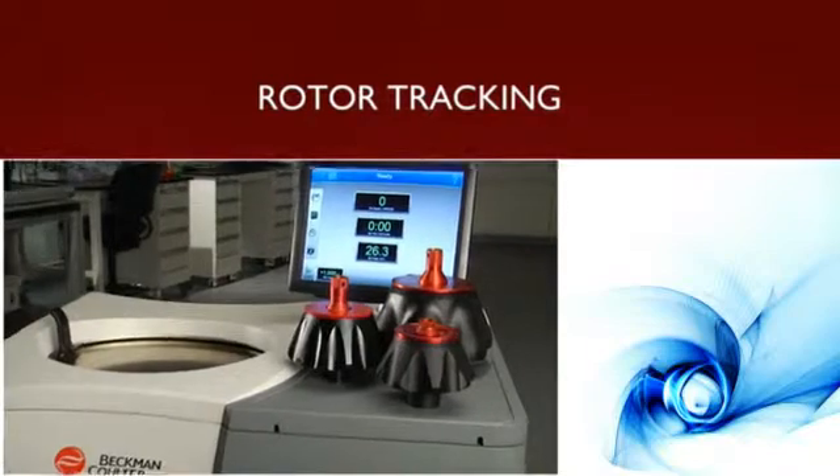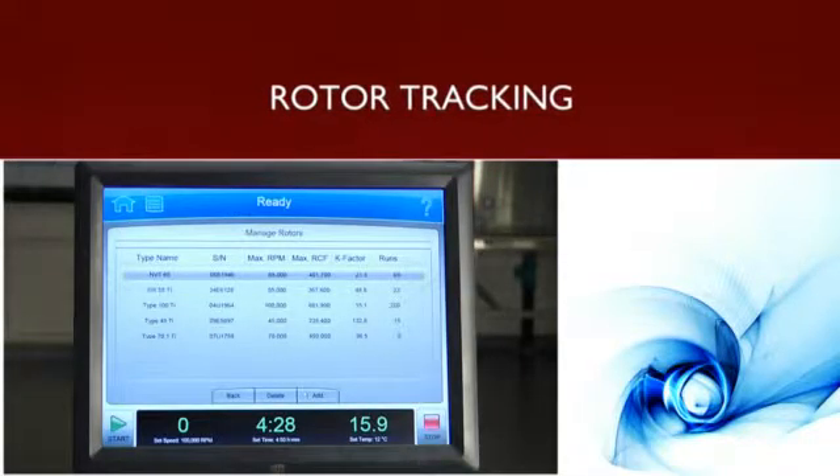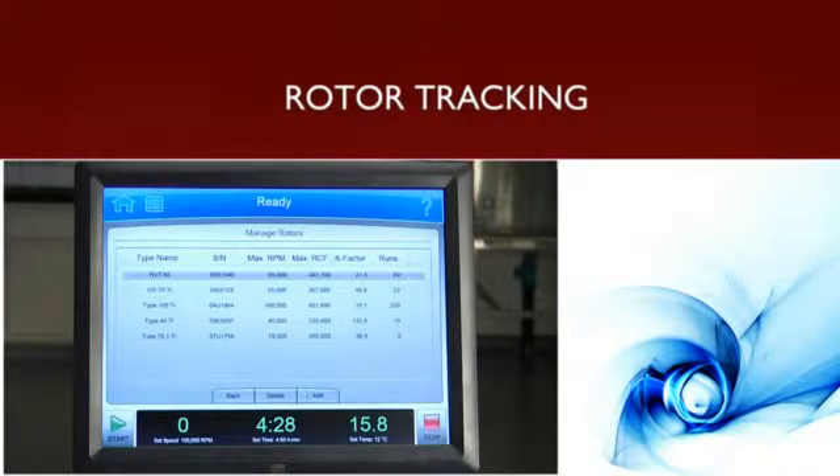The Optima X-PN tracks your rotor usage, so you always know where your rotors are in their life cycle, reducing the possibility of system malfunction and improving safety.